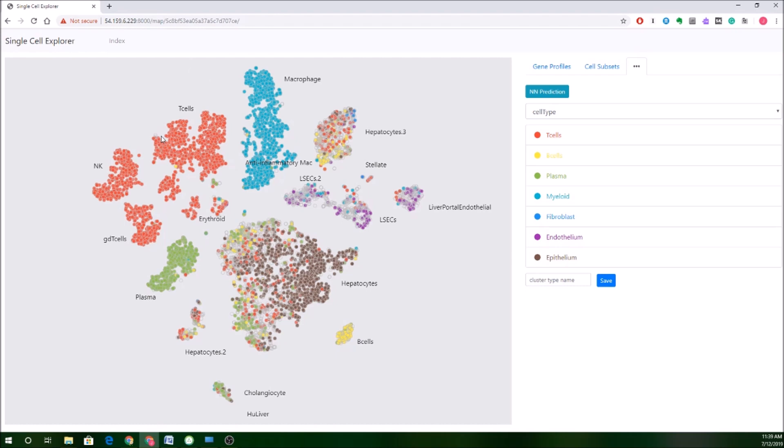So this is really an overview of the major functions that you would be using for single cell explorer. I really hope that you check it out and find it useful for your own research. We've certainly found it to be very helpful for our single cell data sets at Boehringer Ingelheim, both in terms of improving the quality of our annotations, but also making our data much more accessible. So thanks very much for your time, and I wish you the best of luck with your research.